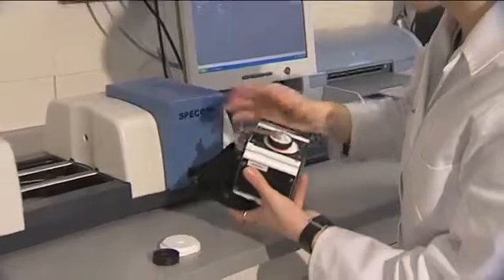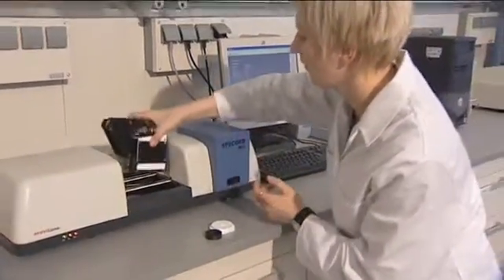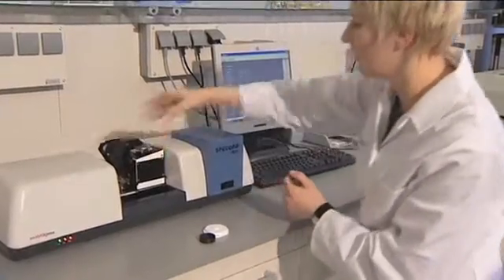Photometric features or colors of substances with rough surfaces as well as powders can be determined by the Spicord S600 and the integrating sphere.